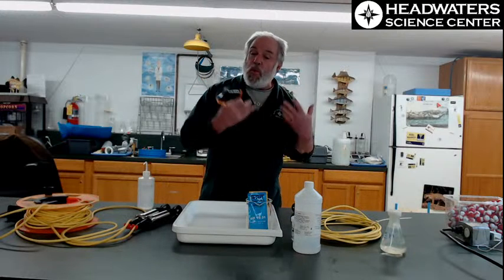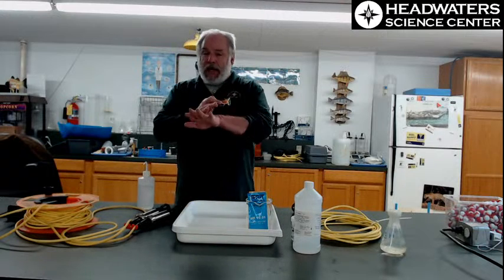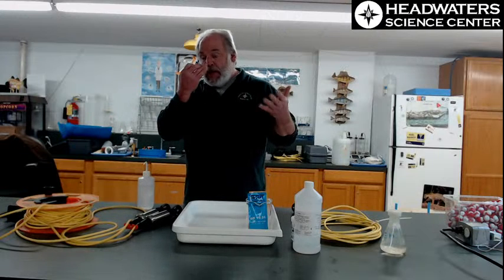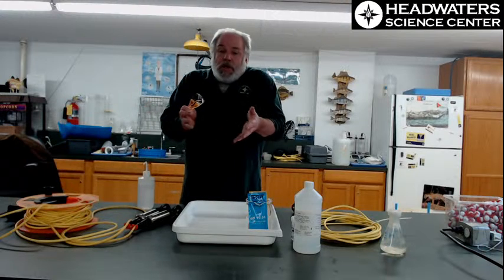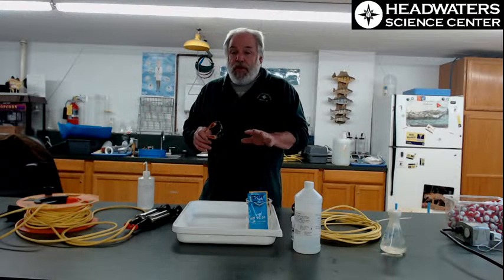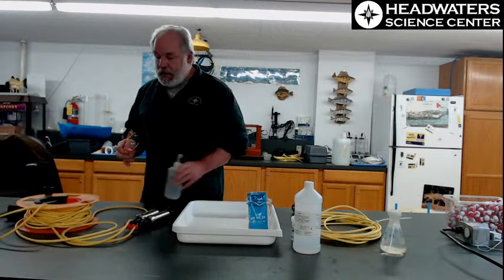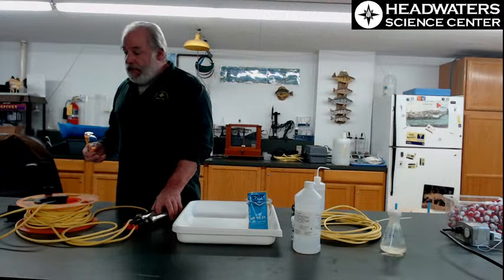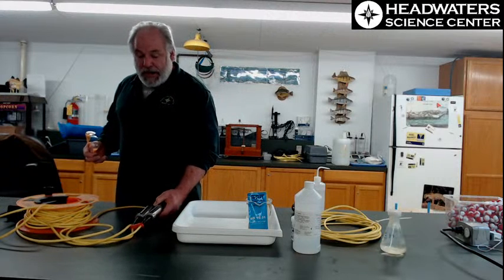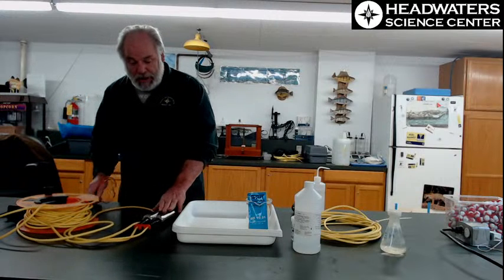While it doesn't tell us what we're looking at, it tells us what kinds of things we're looking at. We're looking at metals, things that make the water more conductive. Water is neutral, so when it conducts better than you'd expect it to in its purest, cleanest form, you go, why? And so then you can look further for other things. And some of the things we do here are just a way to look deeper in our laboratory. A couple of the other things we measure in the field, it's because they're accessible by equipment that's easily calibratable, and that's what we're going to be doing.